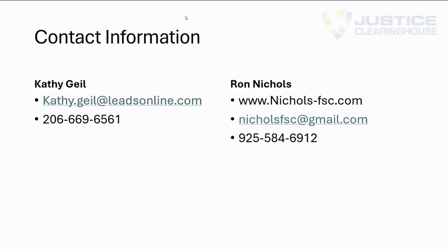Well, I can't speak to Cadre or EvoFinder. All I can do is speak to Quantum. Quantum has developed a very rigorous quantitative measurement that has been working very well. They've spent many years validating that with different comparisons. And they've developed that algorithm so that it is caliber independent.